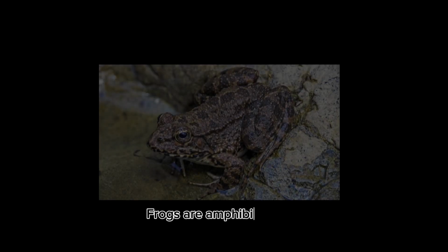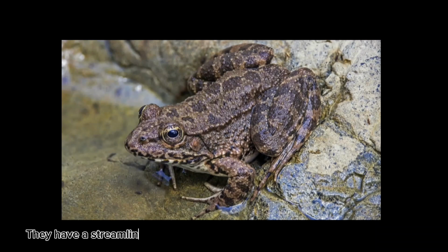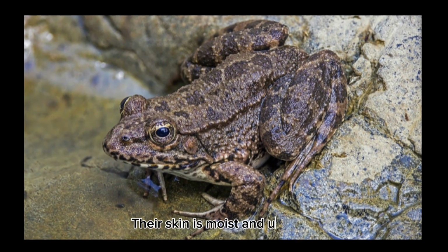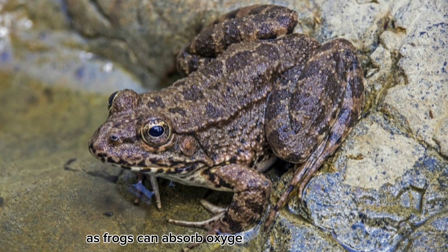We are going to examine the frog's internal organs, learn their functions, and discuss the microscopic world of cells and organelles. But before that, we are going to describe the frog itself. Frogs are amphibians, meaning they can live both in water and on land. They have a streamlined body for swimming and strong hind legs for jumping. Their skin is moist and used for respiration in addition to their lungs, as frogs can absorb oxygen through their skin.